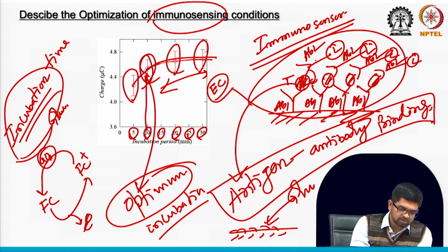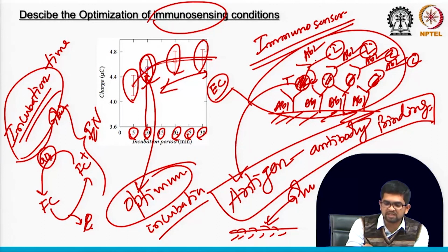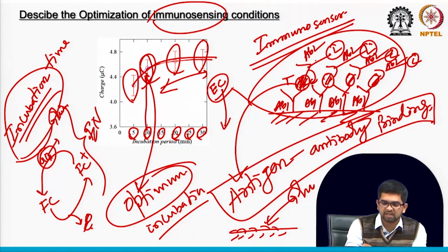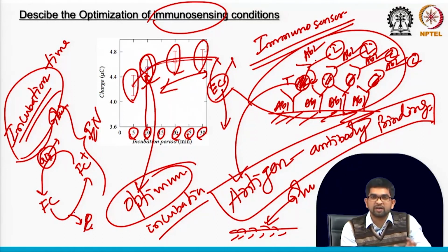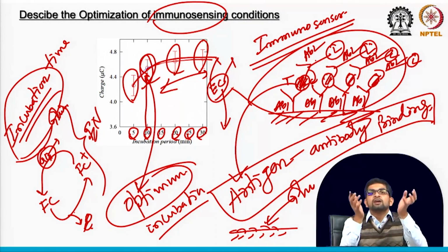So that means ferrocene is oxidized on the surface, and the glucose is what you are trying to detect. This one is the enzymatic, the EN redox cycling, and the EC redox cycling, where there is no enzyme. Without enzyme you can try electrochemical and chemical. For those reactions you may also need some time, because they may not happen immediately, or they may happen immediately, but if you incubate for some time, like 5 or 10 minutes, you may get a very high current.